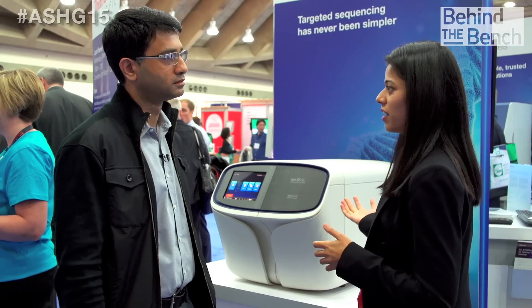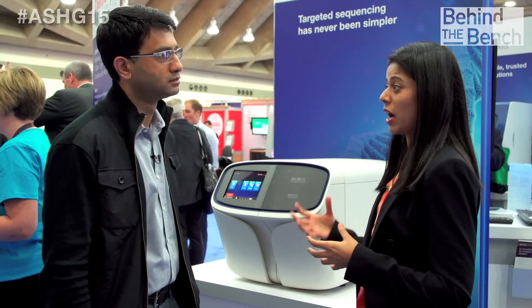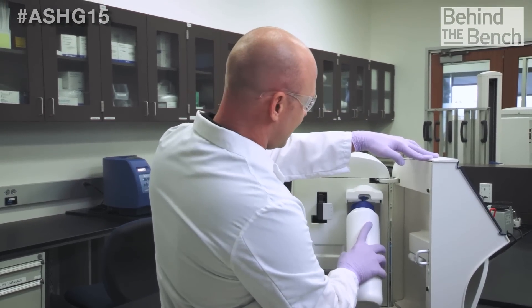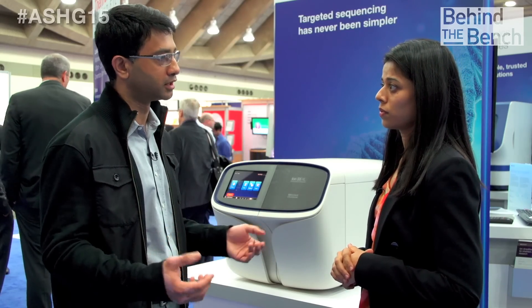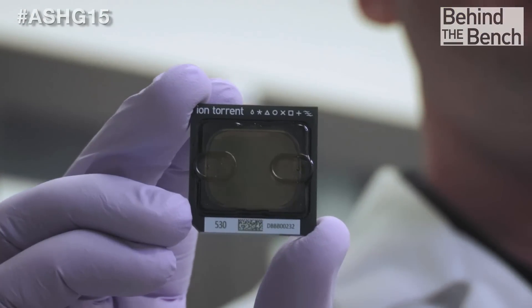Now that the new S5 system has all single-use consumables, customers are wondering about the environmental impact and best practices for disposal. In general, all of our consumables can be recycled, but we recommend following the EH&S guidelines of your institution. We also offer a chip recycling program — previously offered for our 3-series chip with PGM and the P1 chip for the Proton — and now also for our 5-series chip with the Ion S5 system.